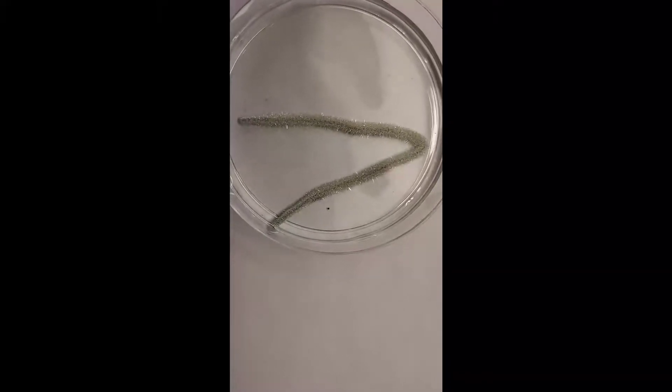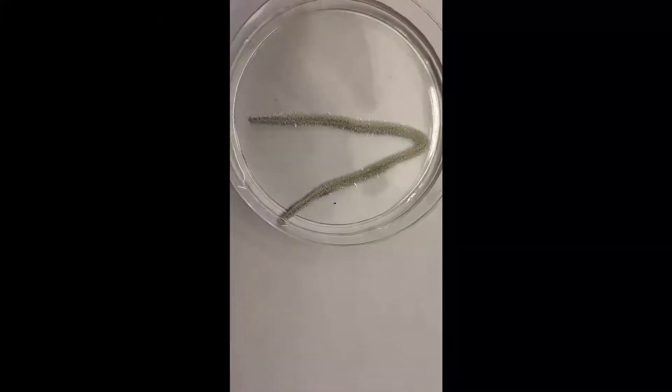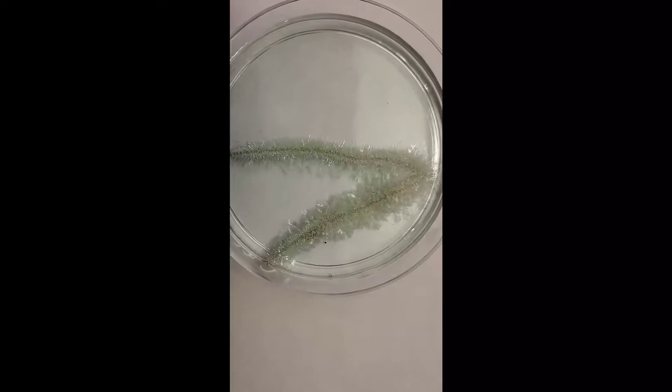I'm gonna let this sit for another half hour or so and show you — this is really cool. Okay, it's been about a half hour and now you can really see all those little silver tendrils. Look at that, isn't that cool?